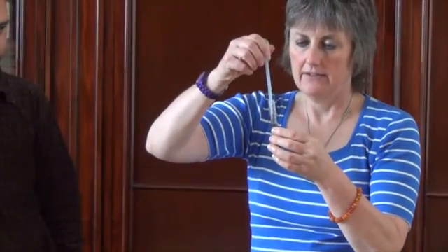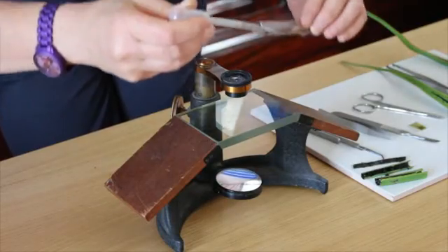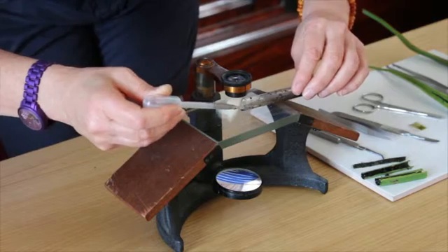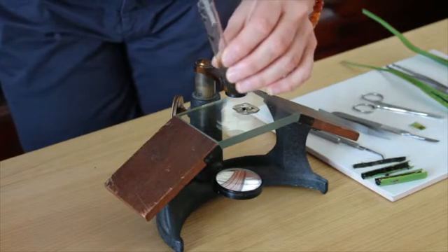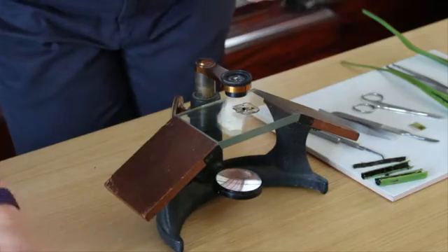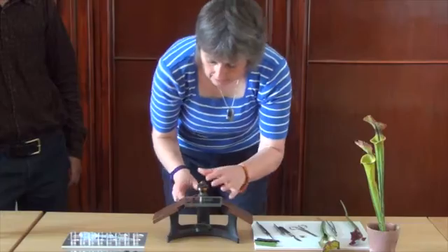What we're going to do now is we have a pipette and a test tube full of rehydrated bodies taken from the trap. We'll put a few of the bodies under the lens. You can also put the liquid with the bodies in a petri dish.